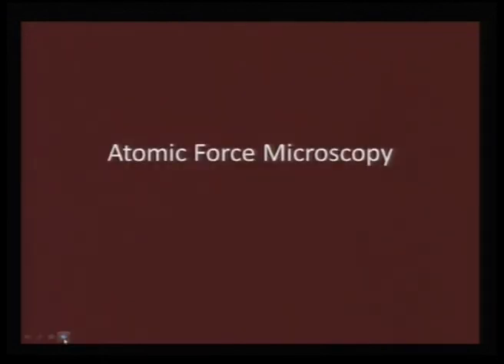Now, when we have a problem studying non-conducting materials, what do we do? In that case, another technique which comes in handy is AFM. AFM is more common than STM, because most labs can afford an AFM. The main reason is that you do not need ultra high vacuum conditions, and second, you can keep it in a very small place; it does not command as much attention as the STM.